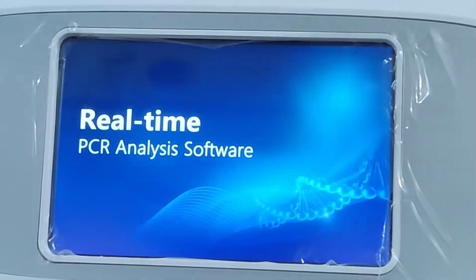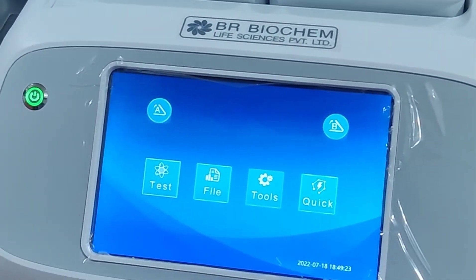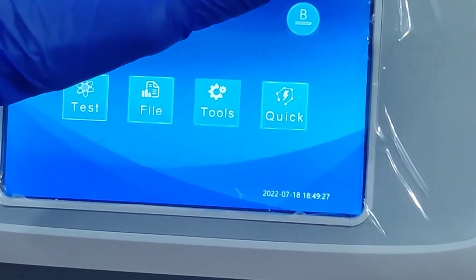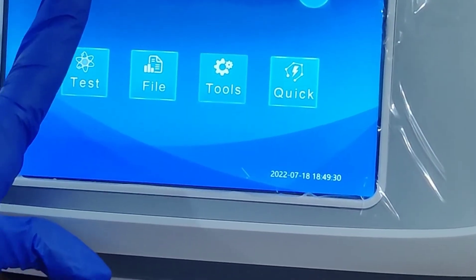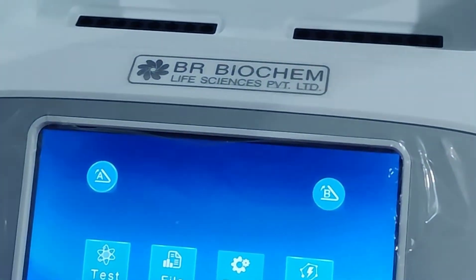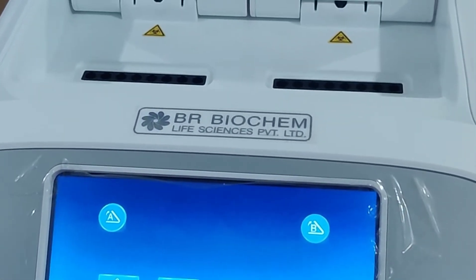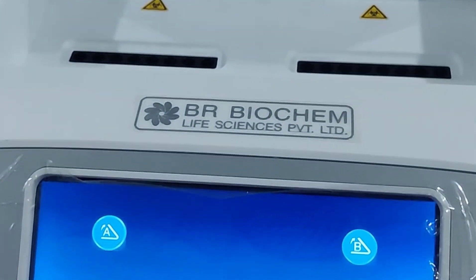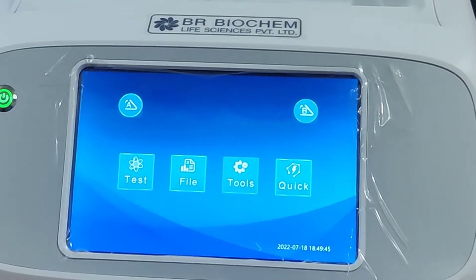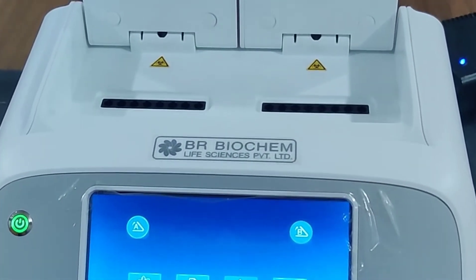You can print all the data directly, so there is no need for another computer. By pressing these two keys, you can open the lid. The hot lid temperature range of this RT-PCR machine is from 30°C to 110°C, and the maximum ramp rate is 6°C per second.